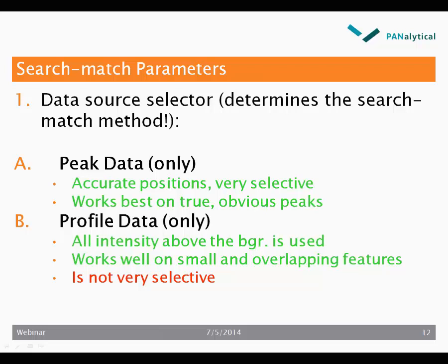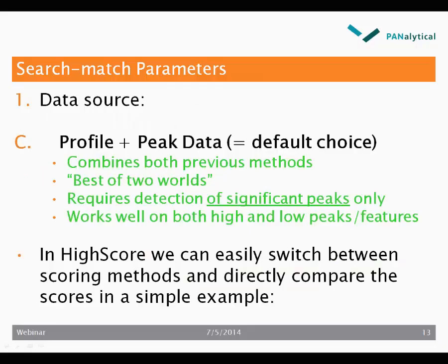Or we could use profile data only. This is the modern way to perform search match. All intensity above the background is used. A peak search is not necessary. This works well on small and overlapping features, but is not very selective.